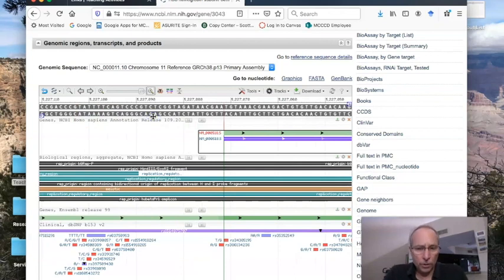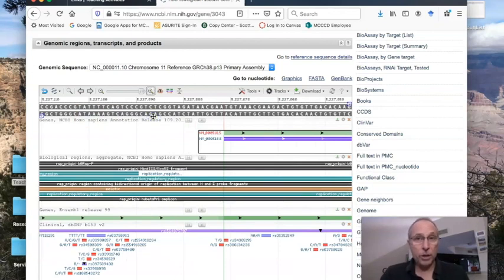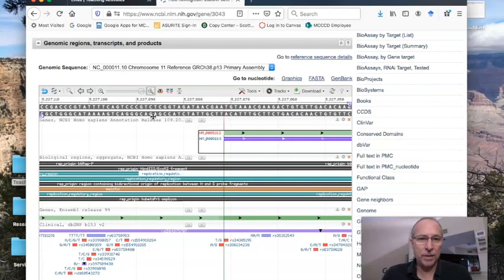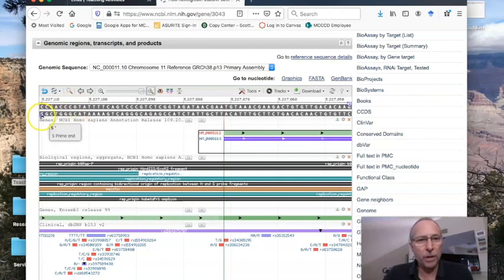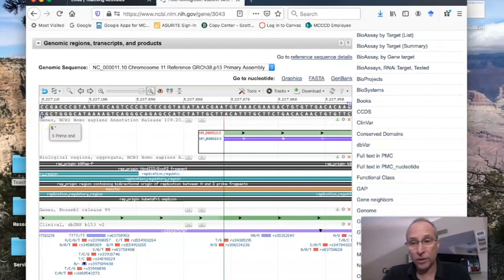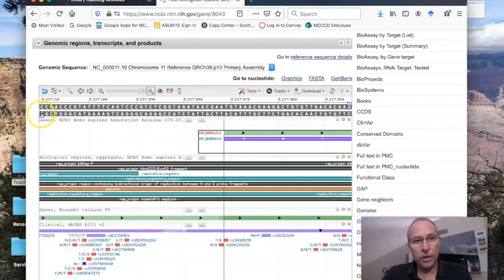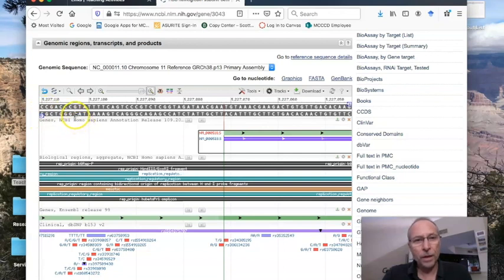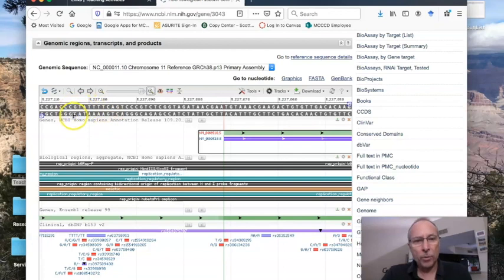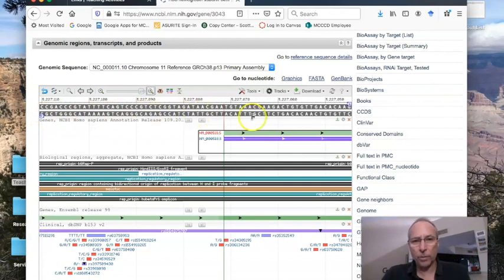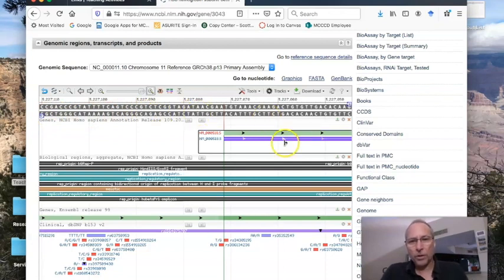In this particular gene in human beings, there has been a mutation. It's not TATA, it's CATA, C-A-T-A-A. And there it is right there. There's the five prime end. The lower strand is the five prime end. You've got to watch that. Sometimes it's the upper strand in this browser, but in this case, the lower strand is the five prime end here. And there, C-A-T-A-A-A. That right there is the TATA box. We're reading the bottom strand from left to right because that bottom strand is the five prime to three prime end that way.